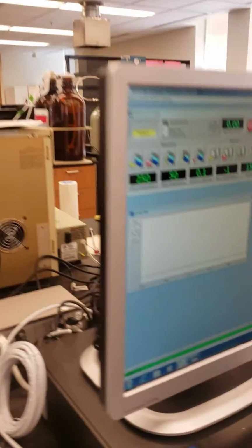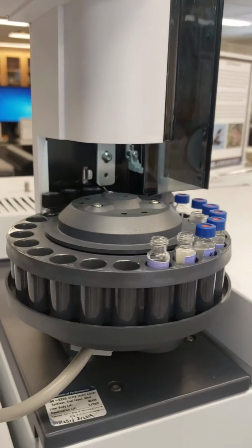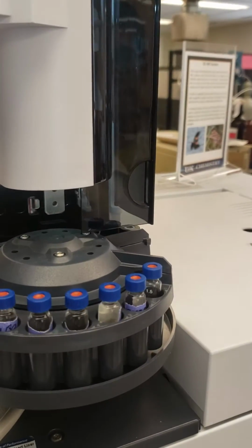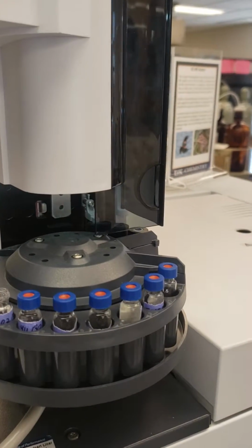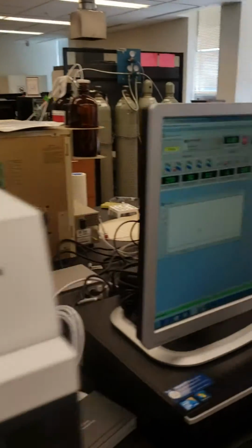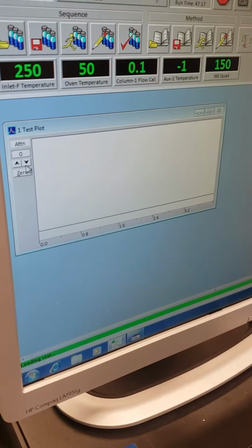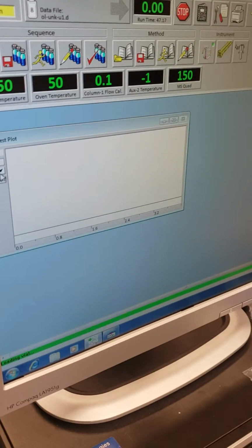There should be another plot somewhere. I'm not seeing the second plot. Usually it shows all the plots up. The one is just like a pattern and it tells you what you want to spec. Yeah, it's different. Or it thinks it's different. One of the two. And the other is the actual preliminary, this real-time plot. I think that's what this is. You can move the continuation up and down, but there's not much you can do with it because this isn't analysis software. So it's just there for your viewing.